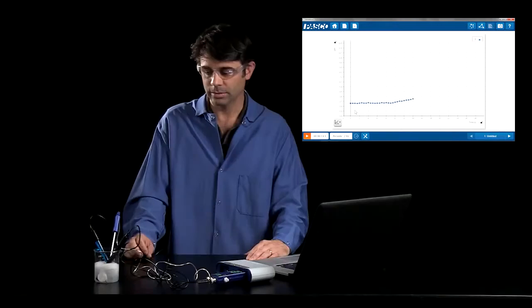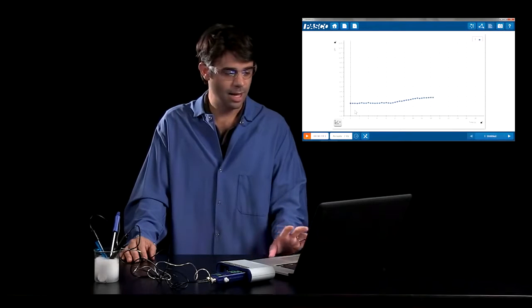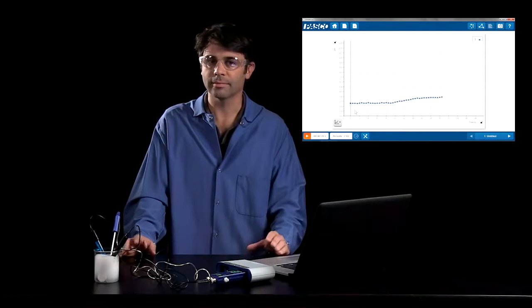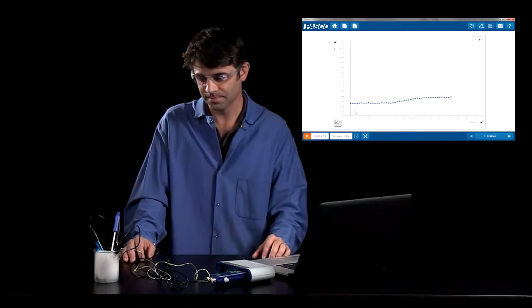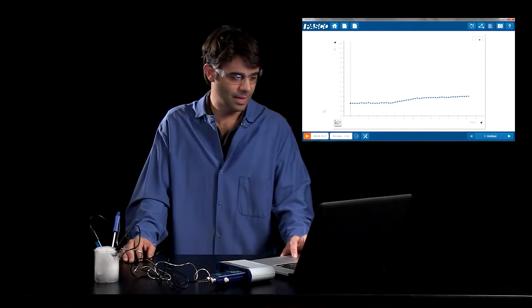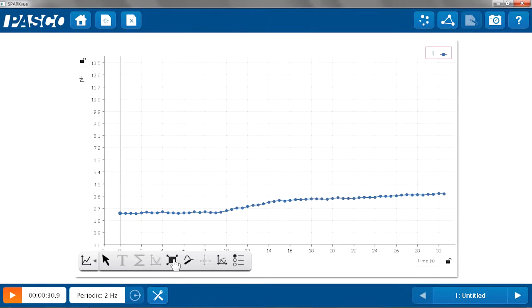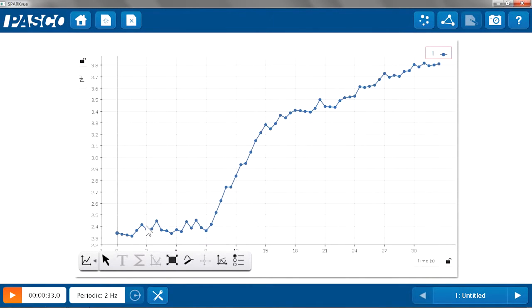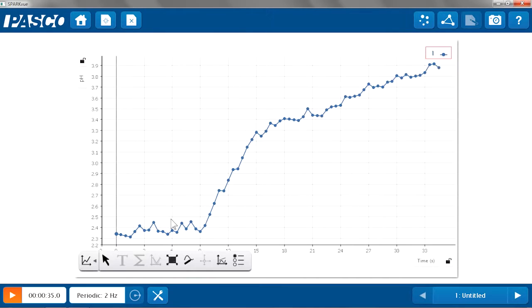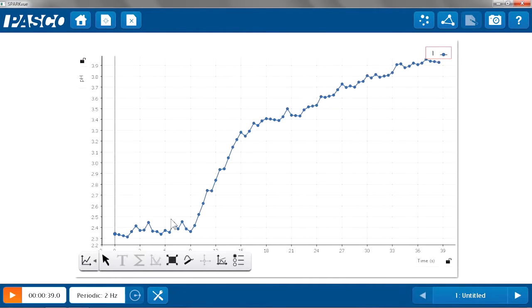And we get our characteristic bubbles of CO2 forming. We can see that the pH is changing because of that, the Alka-Seltzer being an antacid, or a base in this case. We'll auto-scale this and see how the pH is changing. There's a pretty dramatic rise in the pH as the reaction proceeds. The bubbles form, and the acid is beginning to be neutralized.